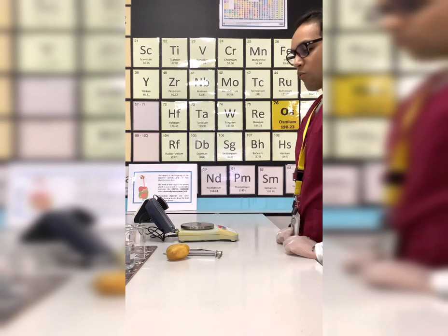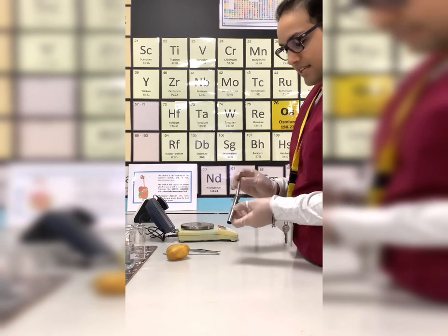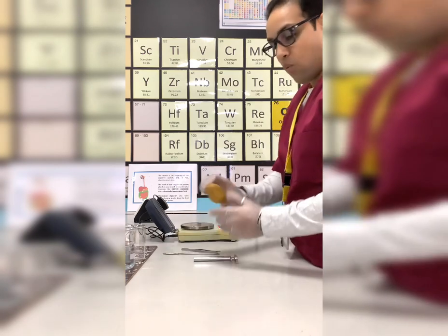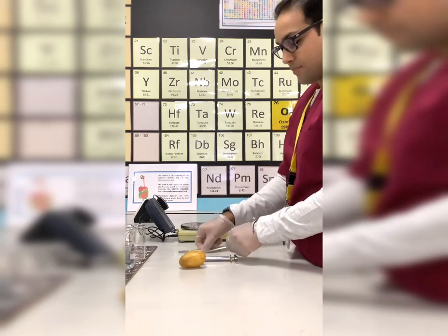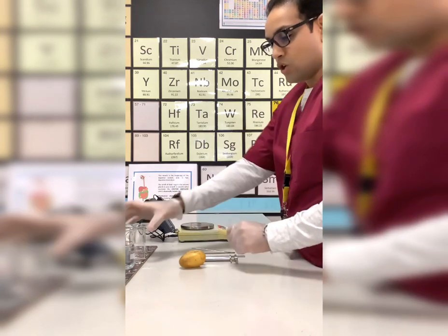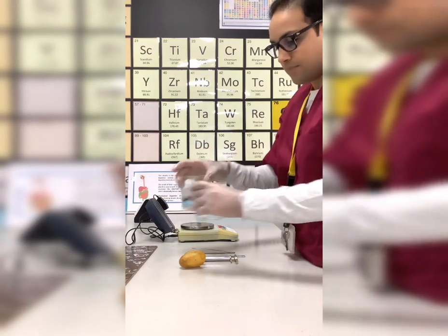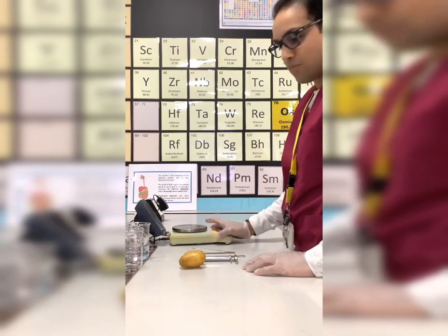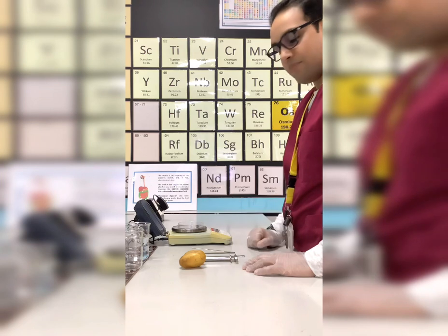So the materials required are cork borers. I have chosen the big size ones as these are very good and useful. We can get a good thickness of the potatoes. One potato, a large one. Scalpel, forceps, two beakers, one empty and one filled with distilled water. Measuring balance, as accurate as possible, I'm using 2 decimal places. A petri dish to place over the balance.